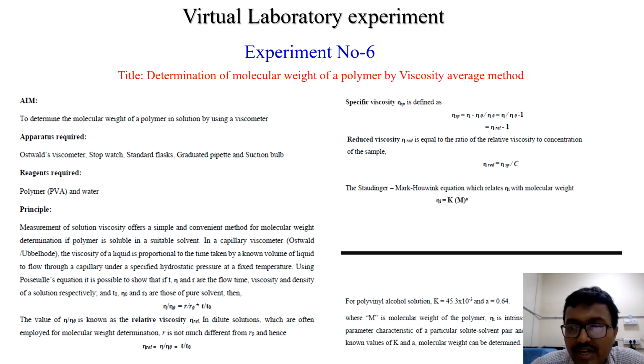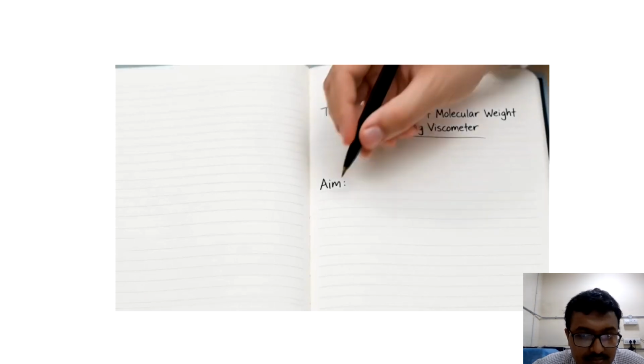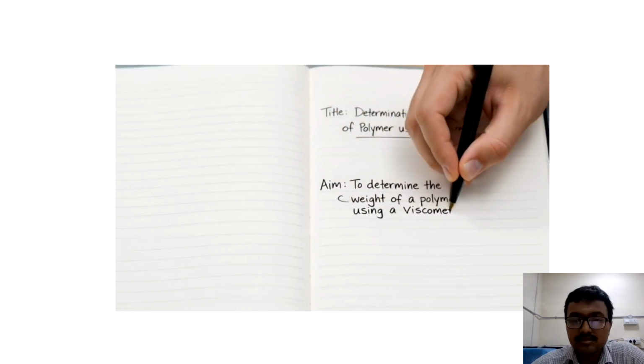Now I will show you the video. Okay, next slide. There is a full video you can understand. Title: Determination of molecular weight of polymer using viscometer.